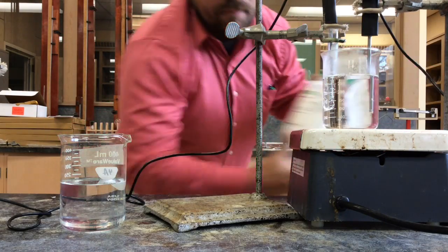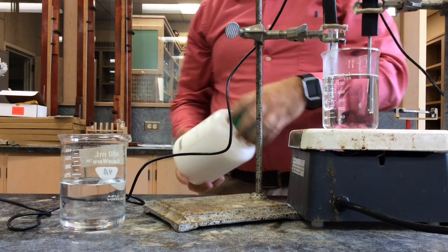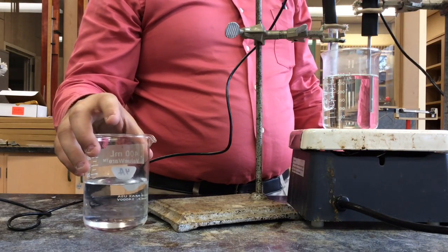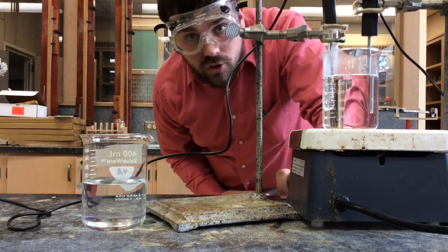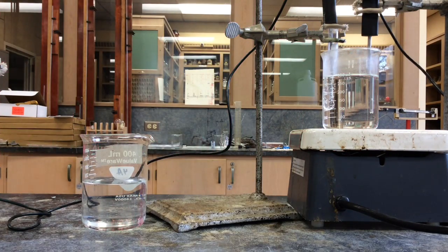However, as a solid, I don't know if you can see this or not, it's a white powder. And you'll see it later for sure. So what I'm going to do is I've got this beaker of just room temperature water right here. I'm going to take this guy out and drop it in there and then monitor what the cooling curve will look like. And so let me get my computer ready to go because I'm going to create the video of the graph that it makes.